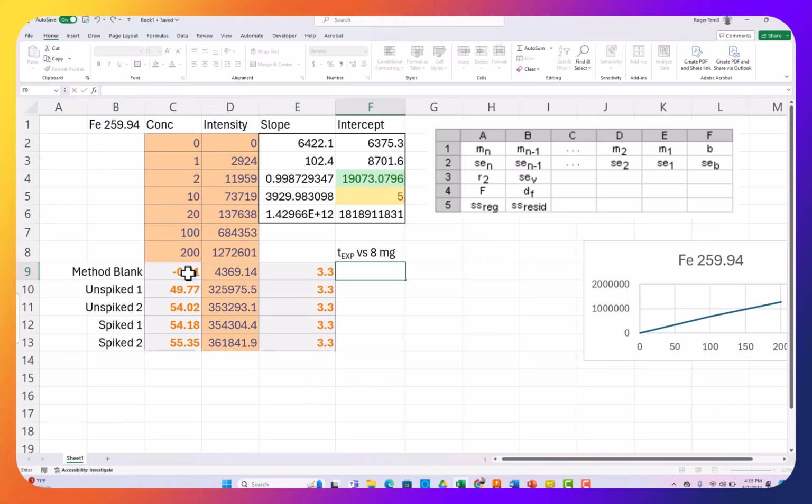Oops, actually, we don't want to do it here, do we? We want to do it down here. This is equal to x bar, which will equal this divided by 10, minus 8, x bar over x bar minus mu. So x bar is C10 divided by 10.